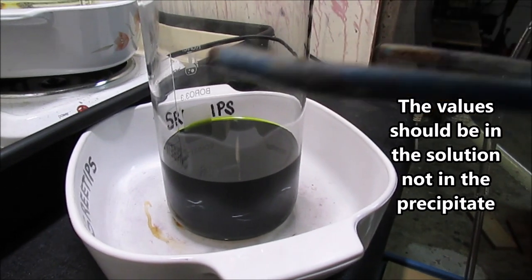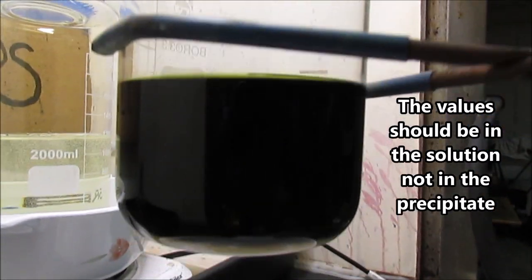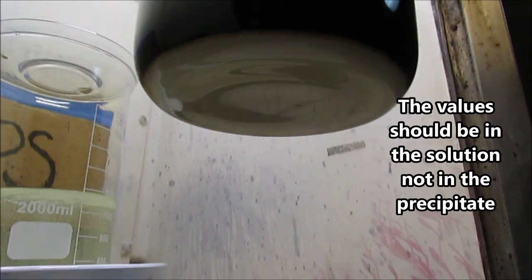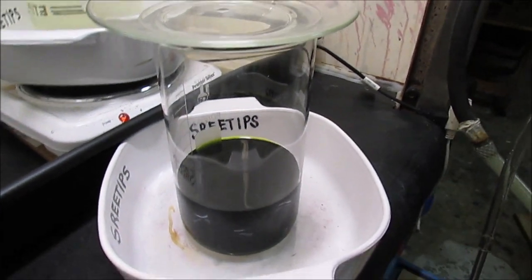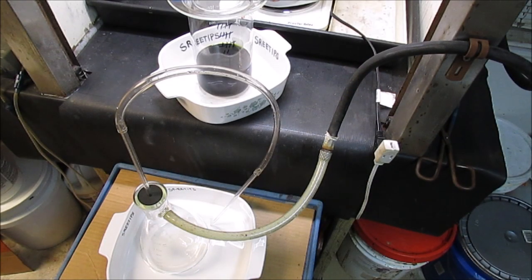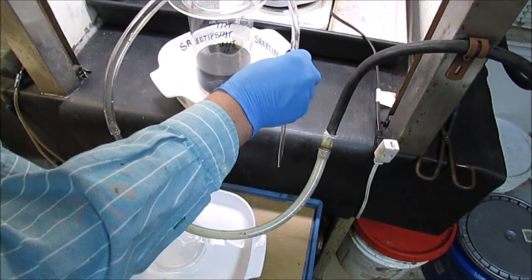We've got a nice positive indication for platinum group metals in solution. I got a temperature reading on the solution: 83.2°C (181.5°F). The last two doses of nitric produced no fumes, so I'm going to conclude that everything has been dissolved. I'm turning off the heat and stirring and letting it cool down. Once it's settled I've got some precipitate down at the bottom, so I'm carefully going to siphon off the concentrated liquid into a flask using a vacuum tube.